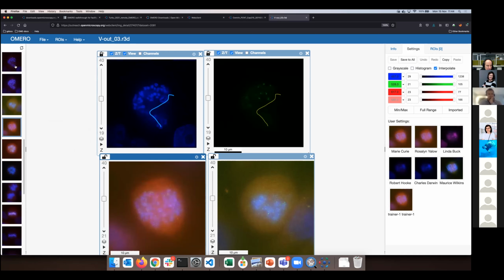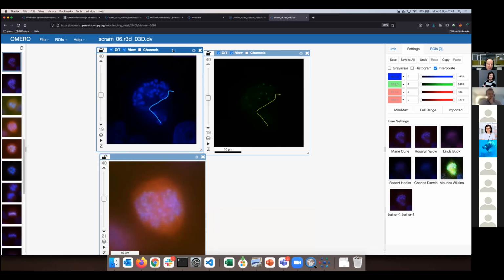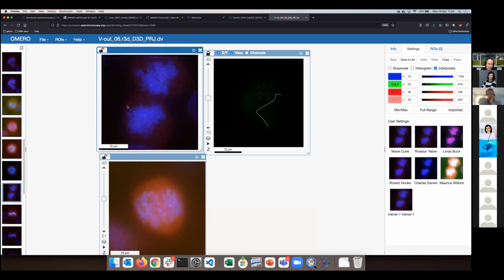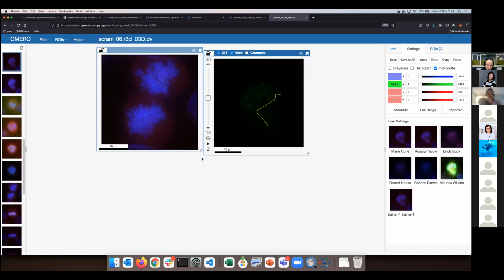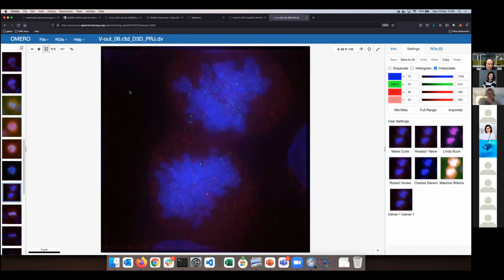You can do some very similar thing. You can, of course, close the viewers. You can do very similar thing by clicking. So if I have a viewer selected and I click once, like so, then I will replace the image inside that viewer. If I nevertheless double click on the thumbnail on the left, then I will be confronted with a new viewer window. Okay, is that clear? And if I want to close and come back to single view, then I can just do it like that. And I can, let's say, fill the screen, and voila, here I am. Okay.